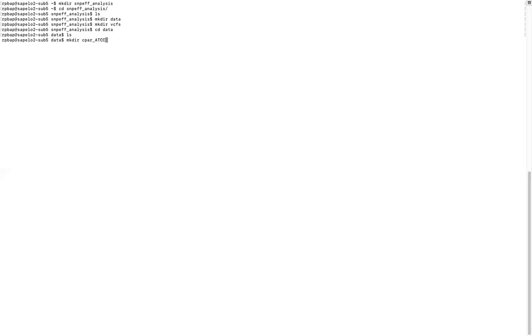Remember that the name you give this folder is the most important thing you need right now. If you name it something like `Ashley_ATCC`, that's fine, but you need to remember to use the exact same name in your config file to run SnpEff. When you create it, you will see a folder called `cpar_ATCC` — let's go inside it.